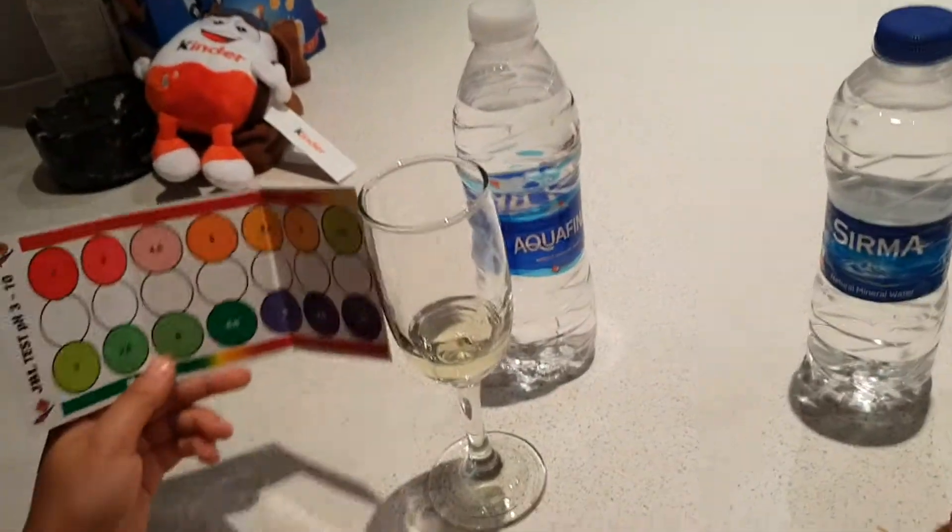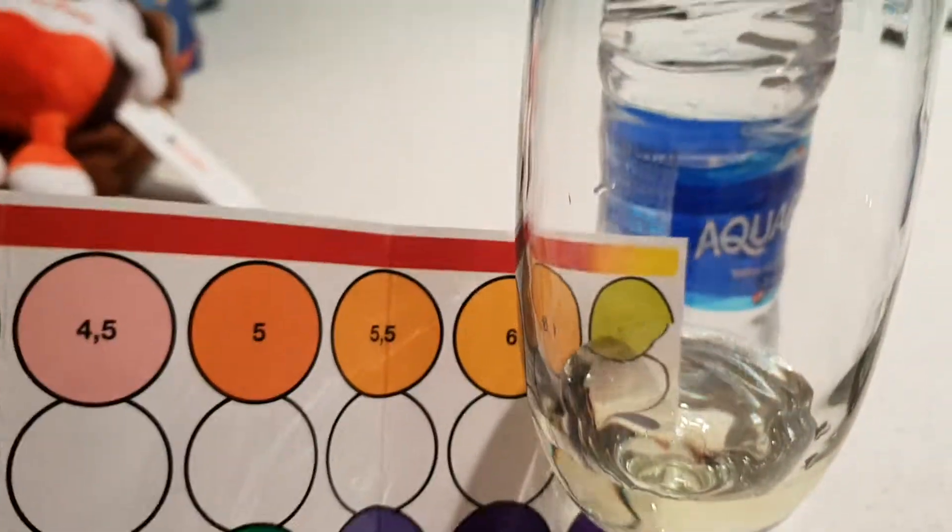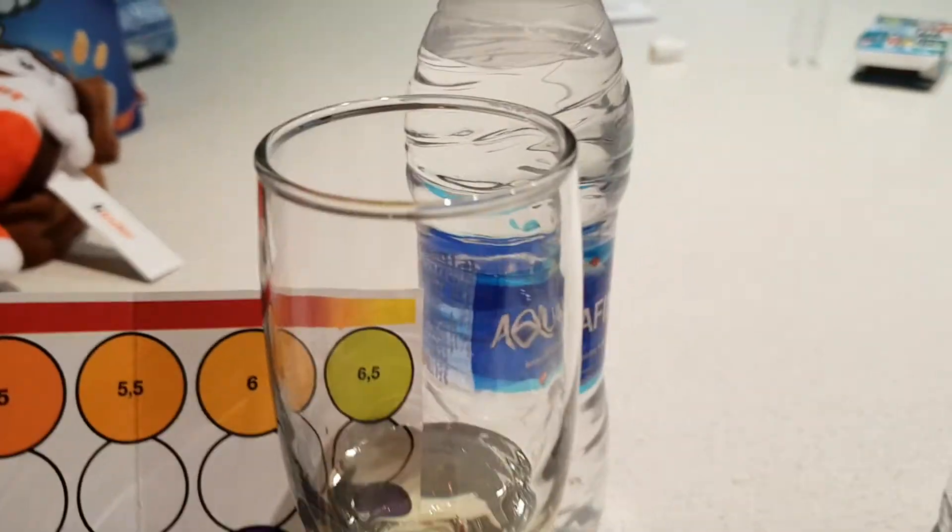And this is the last one — Aquafina. Yellow. That's quite yellow, very yellow in fact. That's 5, or 5.5. That's very yellow.